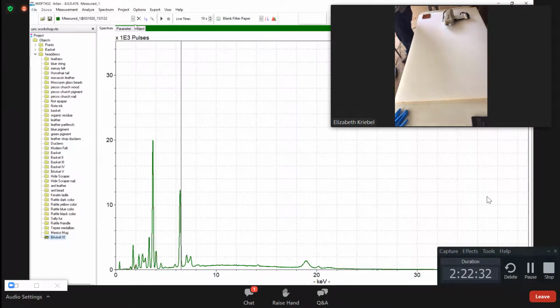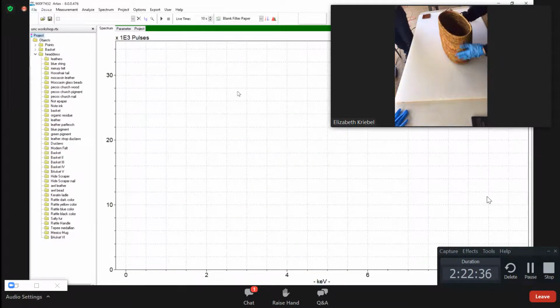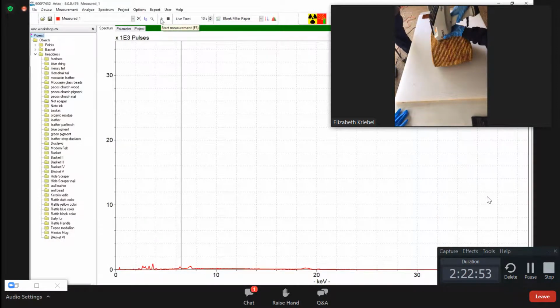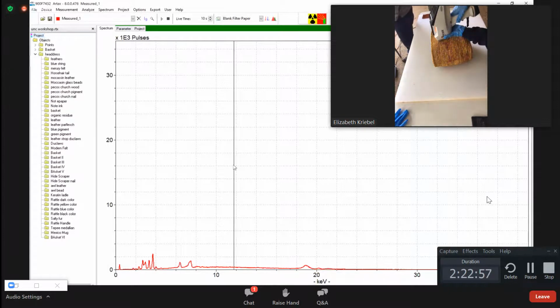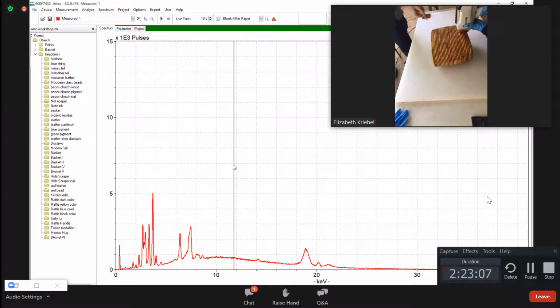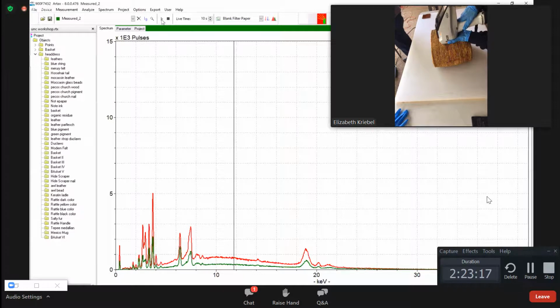That should go pretty quick. Now this one has some dye on it, so I don't know if we want to. Yeah, let's try and skip the dye. If you're worried about mercury, we can measure the dye separately, I think. But yeah, let's try and get a neutral area. So right there. All right, ready? Ready. Starting. Yep, this one's non-toxic. And then let's get the red down here too. Actually, darker red would be better. Okay, let me know when you're ready. Right over that dye. Hematite, which is more iron, but that's about it.